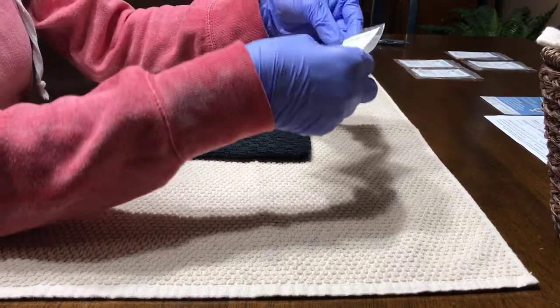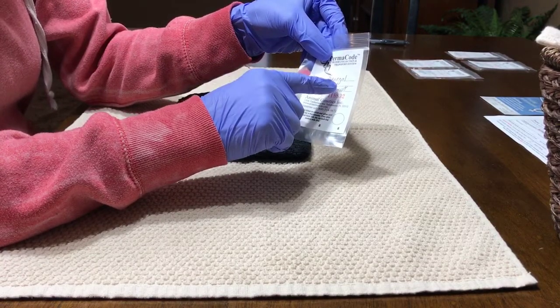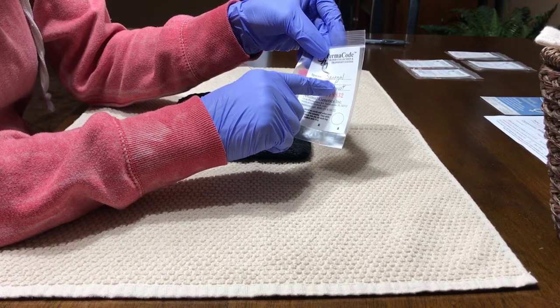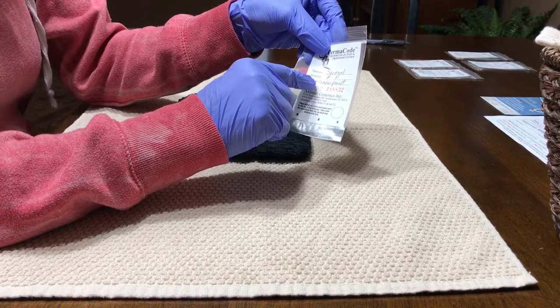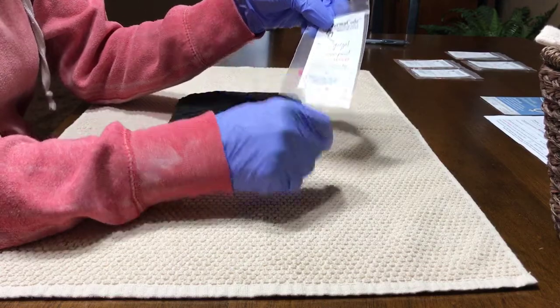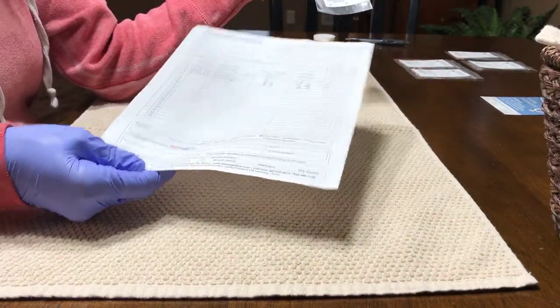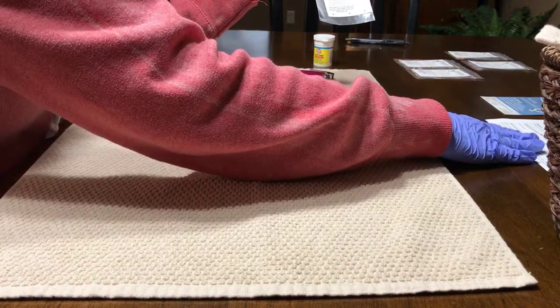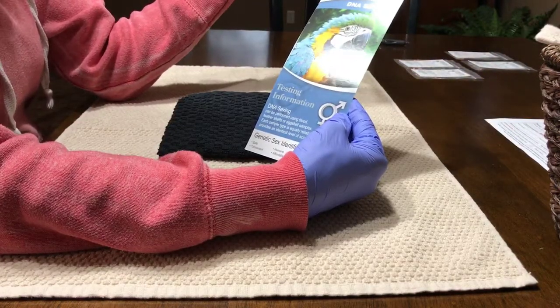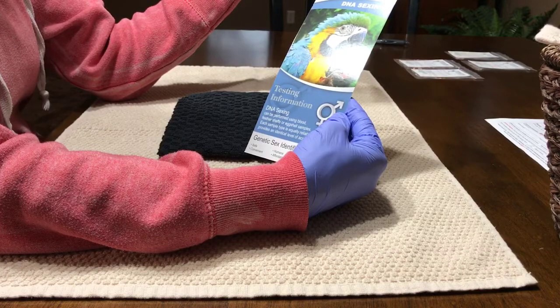We have a little sample card that we've ordered. It's going to have the species of the bird, the bird's ID, and if it has a leg band — in this case our baby Senegals do not have leg bands for this clutch. It also has the owner of the bird, and each sample card has its own ID number. This is from Animal Genetics. You just fill out the paperwork — pretty easy. They send you a card that has DNA sexing information on it, and it's pretty interesting how they determine from the blood sample if it's a boy or a girl with avian birds.